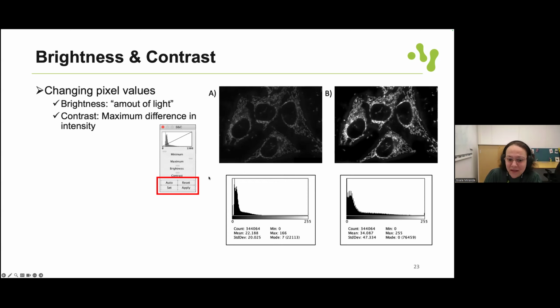So here we are in the 8-bit world, and it's pretty much dim. When we enhance contrast, we are rescaling the intensities to the whole range available. And why do we do that? We can do that to inspect the image, or even as a pre-processing step to help with segmentation.